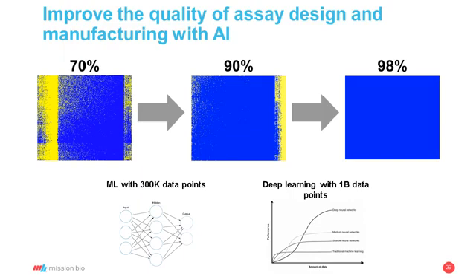And using that, we were able to improve the quality of the amplicons from 70% to 90%. The features that we found are not that novel. These are things that any of us who have done multiplex PCR have seen before. GC content makes a big difference in the quality of the panel. The complexity of the DNA there, the mappability or the repeat elements, these are all things that cause the quality of the panel or the quality of the amplicons to suffer.